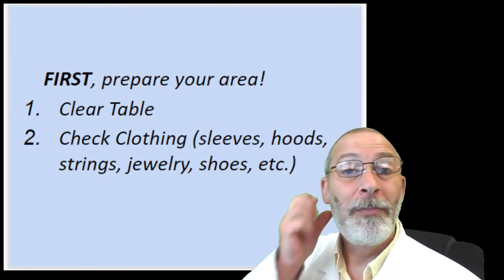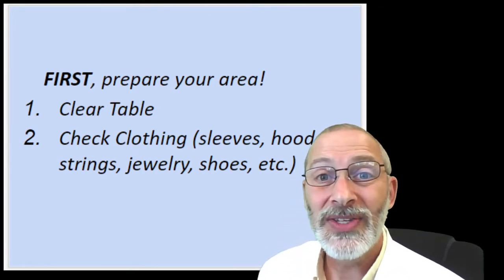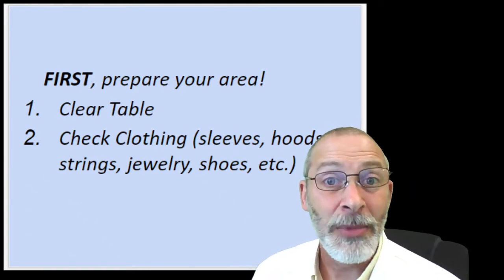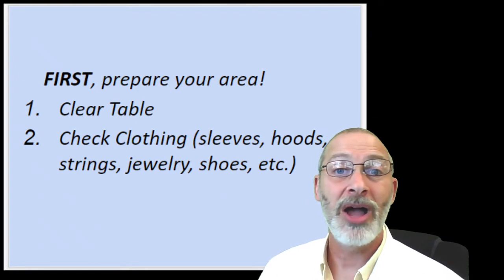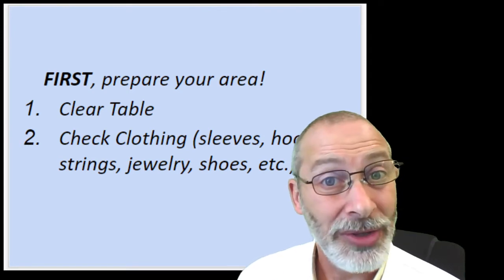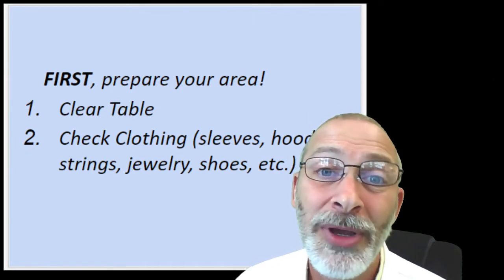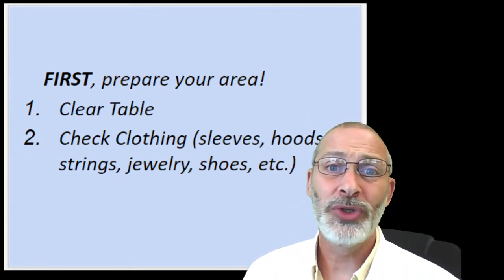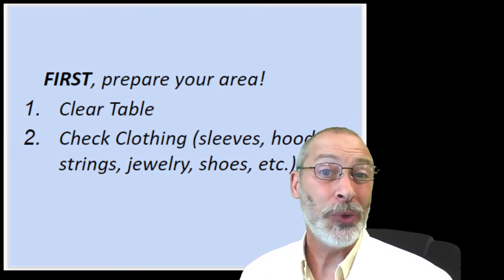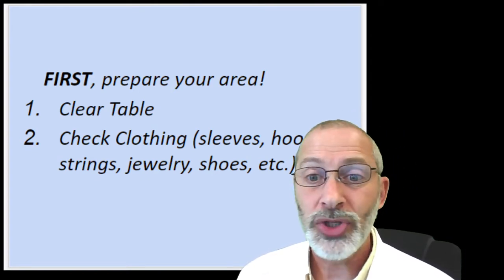Jewelry, big dangly earrings or nose rings or necklaces. Don't wear them on lab day. If you have them on the day of a lab, that's fine. Take them off before you participate in the lab. Put them in your pocket, put them away, because oftentimes those metals that are used in jewelry could chemically react with the chemicals we're using. I don't want them to start dissolving your flesh later on in the day because you had jewelry that is slowly chemically reacting with some of the chemicals we use. So just don't wear the jewelry.